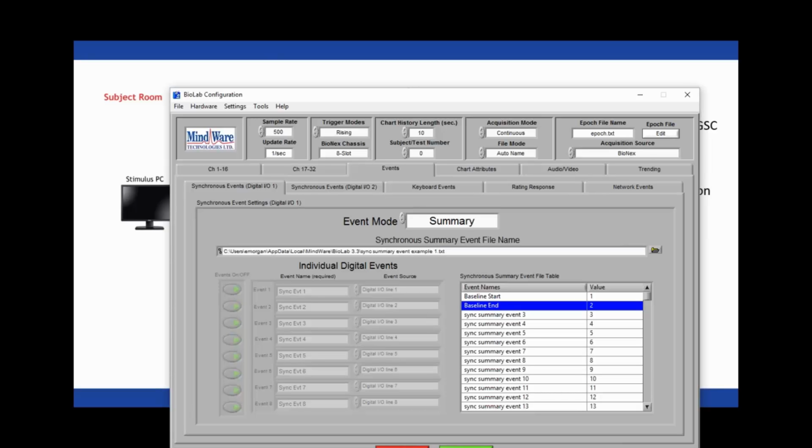So once you get to know the configuration screen in BioLab well, it can be pretty quick and easy to get from scratch to a workable solution with a variety of common configurations that people use. So it's definitely important to get to know the screen well and understand all of the settings that are available to you.